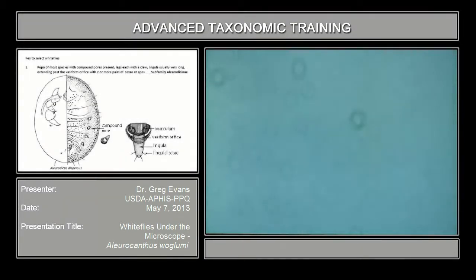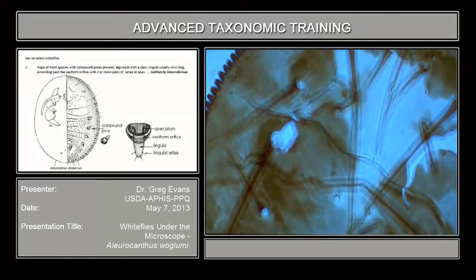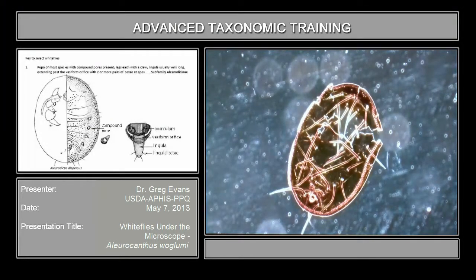If we'll move to the next slide, which is the Aleurocanthus slide. This species in real life is very black and you need to stain it. You have to bleach it to get the color out of it so you can see the structures.